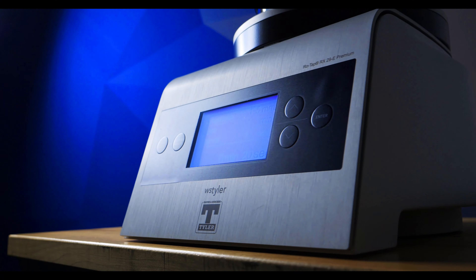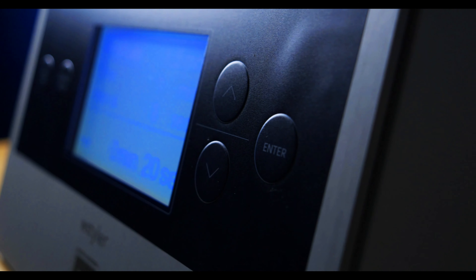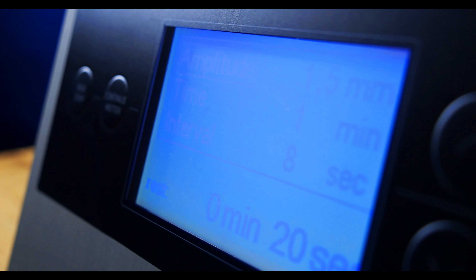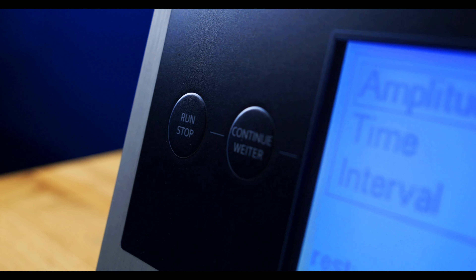If you're looking to invest in a Rotap RX-29 ePremium electromagnetic sieve shaker, you can expect to pay approximately $6,800. But this price only reflects the device itself and does not include any additional test sieves that you may need. When working with mechanical sieve shakers, a sound enclosure kit is recommended to dampen the noise created by the hammer tapping motion. Since the Rotap e-devices don't utilize this hammer, they're much quieter and eliminate the need for a sound enclosure kit, as well as the expenses associated with it.